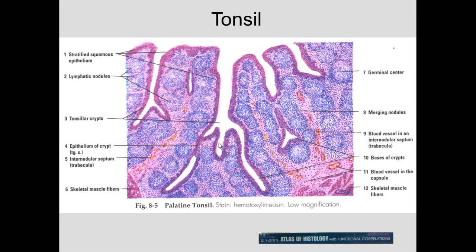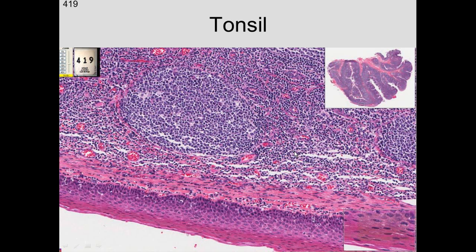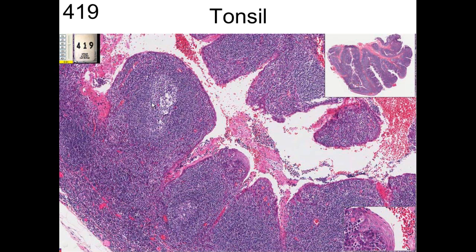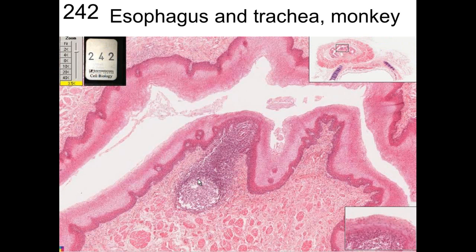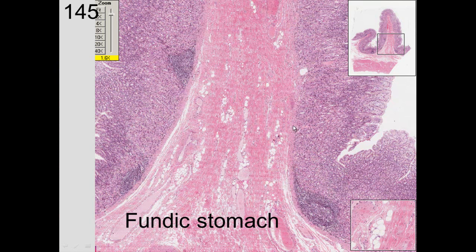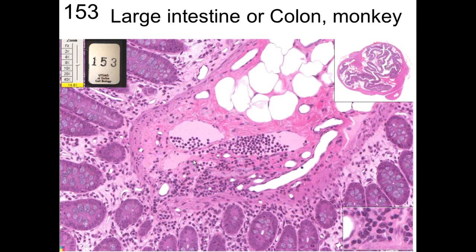Another organ in the oral cavity is the tonsil, which has stratified squamous epithelium with lymphoid nodules bearing germinal centers and surrounding lymphocytes. Further down the esophagus we again see stratified squamous epithelium with lymph nodules, and lymph nodules are found throughout the GI tract — in the stomach and elsewhere — with a high density of various white blood cells.